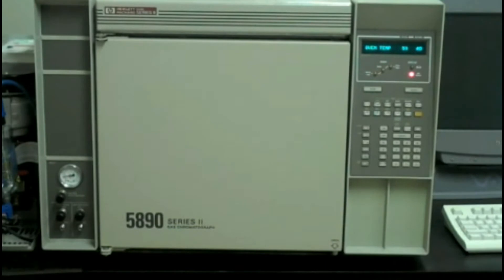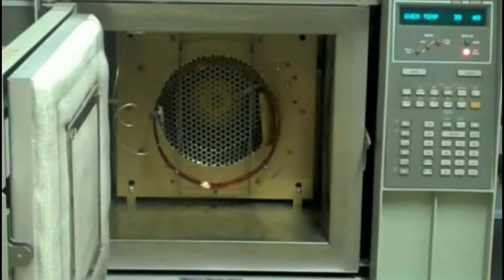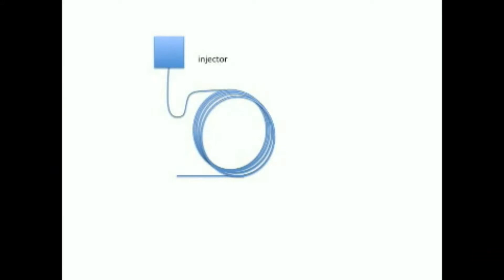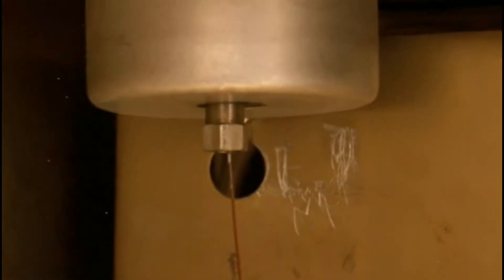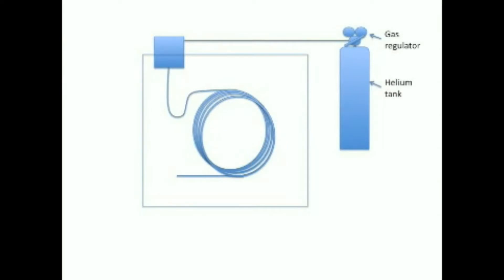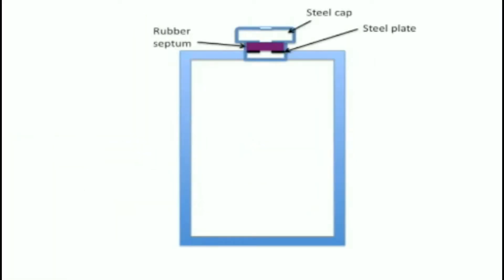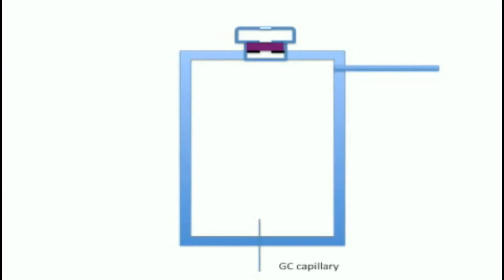You can check out the GC column by opening the door to the oven. The latch for the door is in the lower right-hand side of the oven. The column is supported on a wire frame and is connected by means of special fittings to the injection port at the top of the oven. Samples injected here quickly vaporize and are pushed onto the GC column using helium carrier gas. The other end of the column exits through the oven wall to the left and goes onto the mass spectrometer. Let's take a closer look at the injector — it can be heated separately from the oven to a high temperature that ensures samples vaporize quickly upon injection. Sample is introduced from the top through a rubber septum. Helium comes in from the right, pushing the sample toward the capillary at the bottom.